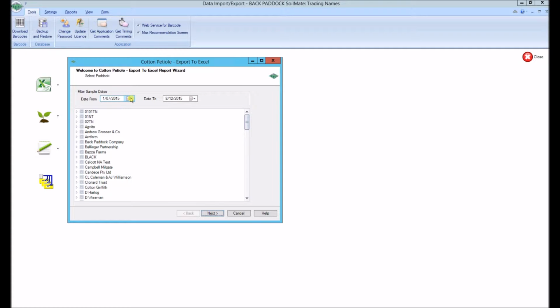One of the things you need to do is to make sure right up front that we actually select the date range correctly. I'm going to demonstrate some from the previous year, so I'm just going to set this up so we go back a couple of years just to make sure we capture the date range. What you'll find is if you don't have the right date range, you won't see the data, and that can be a little bit frustrating.